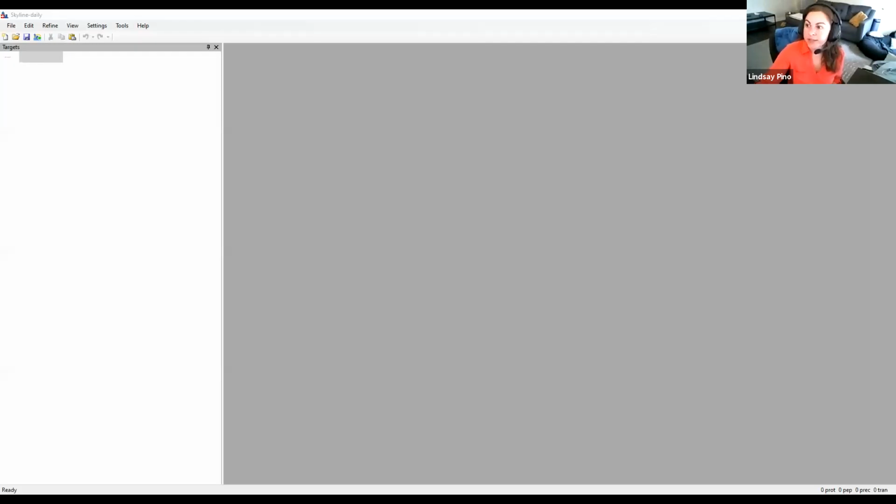So this document, I'll make sure you get a link available. And I'm just going to launch a blank document of Skyline and share that with you. So in this blank Skyline document, and all of this is really fully detailed in the Google document that I'll make sure you all get. The first step, just a totally blank Skyline document. I'll make sure I have my default settings.